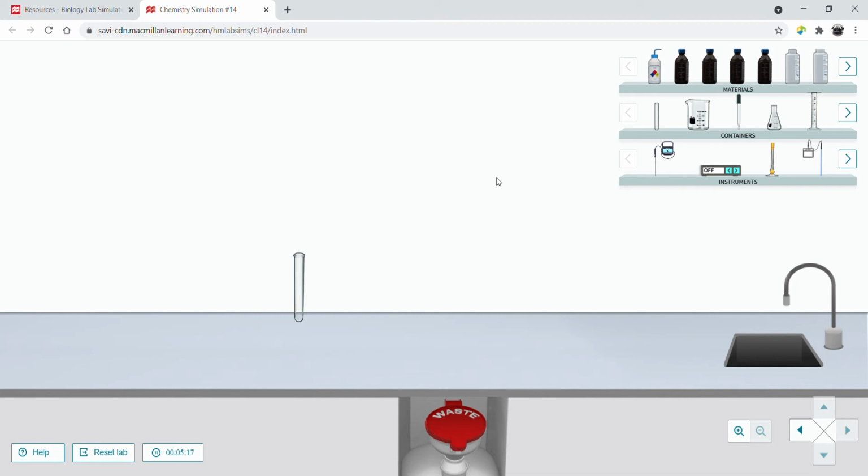And then when we're all ready, we're all set up, we'll add that enzyme, and then we're going to add a gas syringe, because when the chemical reaction is taking place, as we mentioned before, oxygen is released. This gas syringe will fill up with the oxygen that's being released, if any oxygen is released at all. Now we know if there isn't any oxygen released, that the enzyme isn't really working that well. And we know when there's a ton of oxygen released that the enzyme is working very, very well. Okay, so that's our gas syringe.